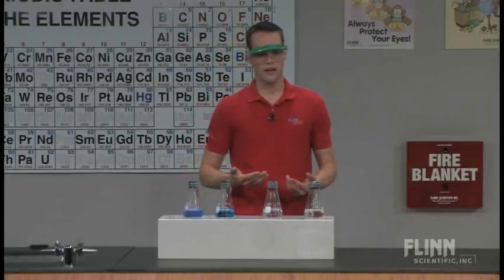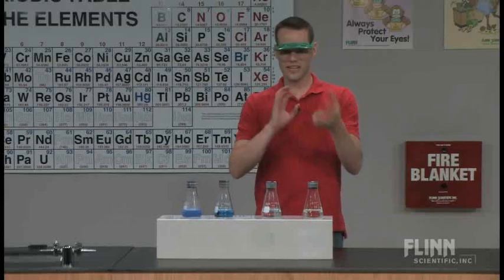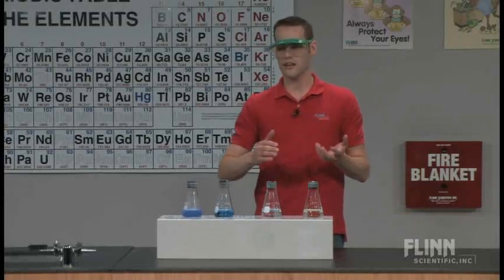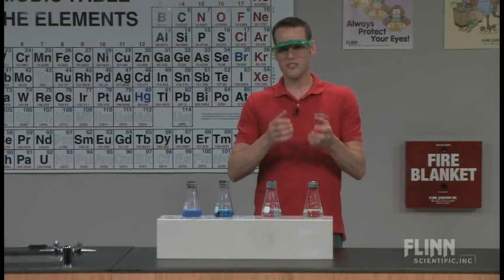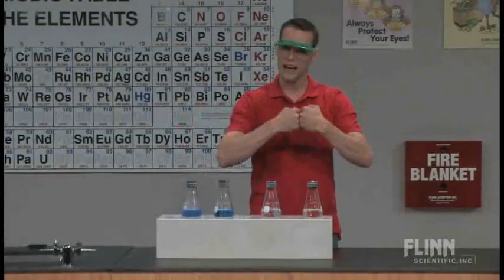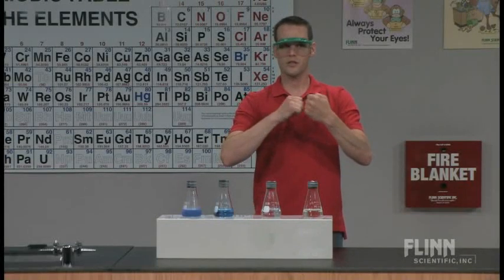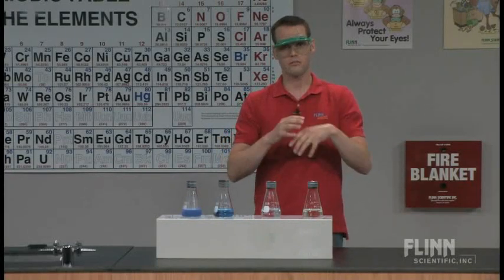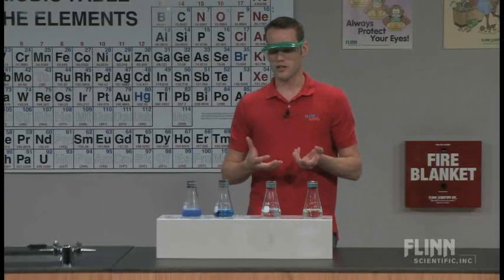So what's happening here? In the hot flask, or the warmer flask, those particles have lots more kinetic energy than they have in the cold flask. So we can get lots more kinetic energy going around. These are bombarding into each other. More particles, when they collide, have enough energy to make that chemical reaction happen. So because we have more particle motion, the reaction goes more quickly. We have more energy available to make that reaction happen.